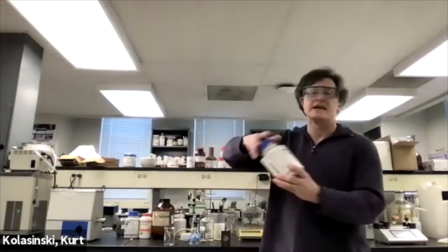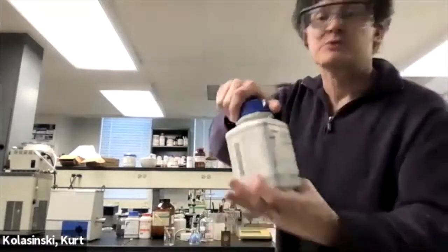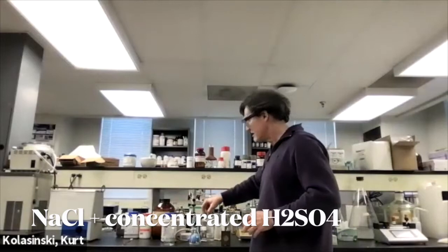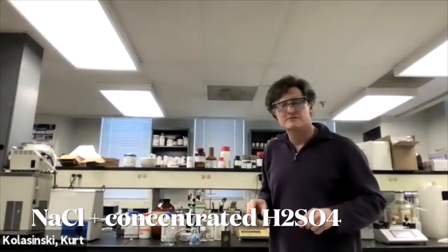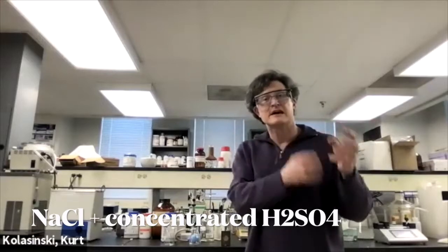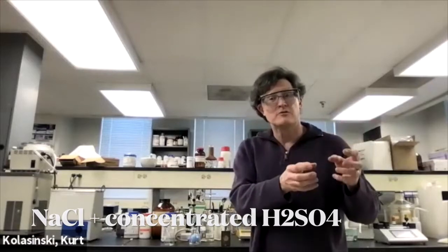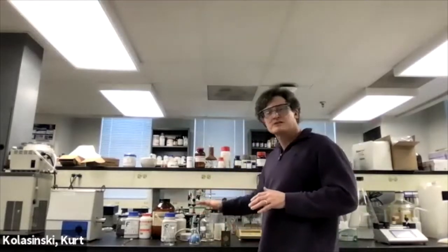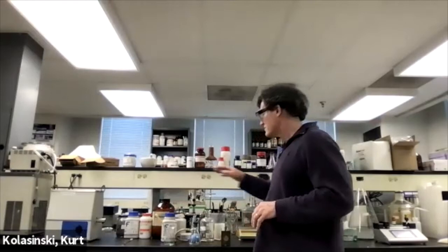We're going to generate HCl from sodium chloride and concentrated sulfuric acid, right? It's got to be concentrated because when you mix sulfuric acid and sodium chloride, you'll generate HCl. But if there's lots of water around, the HCl will just dissociate and dissolve into the water. So we want to have a minimum amount of water. We have concentrated sulfuric acid, we have sodium chloride.